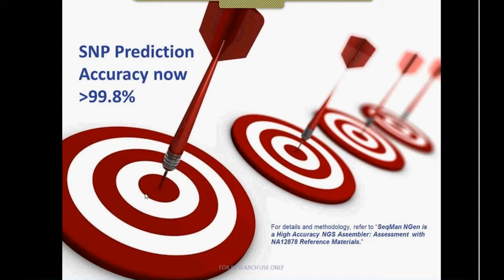We're working to improve that further still, so there's still 0.2% that we're not detecting. And that's for a variety of reasons. It might be assembly issues, it could be data issues, it could be issues with the reference set that's used. That's not 100% accurate. So we are striving to achieve 100% accuracy with our SNP calling.